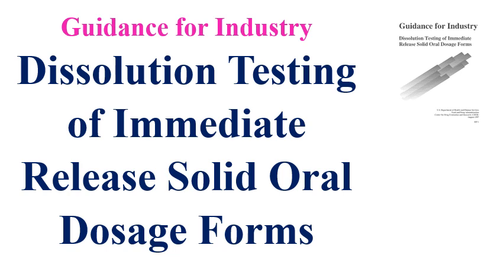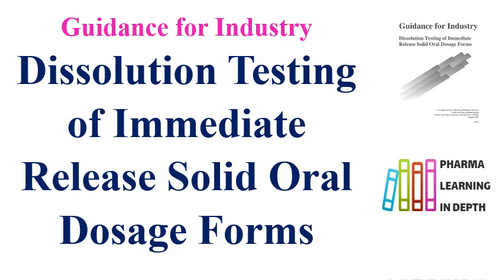Welcome dear viewers to the video on guidance for the industry, dissolution testing of immediate release solid oral dosage forms. For making this video, I have referred the US FDA guidance for industry, and in this video the principles for dissolution testing, the regulatory requirements, quality requirements, and the basics for dissolution testing are covered.